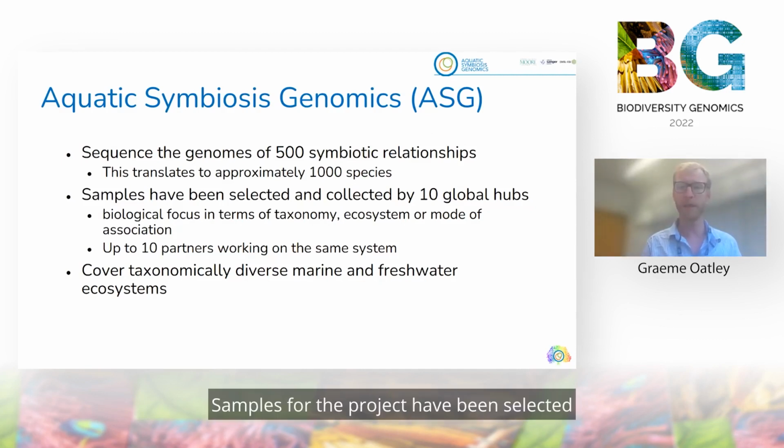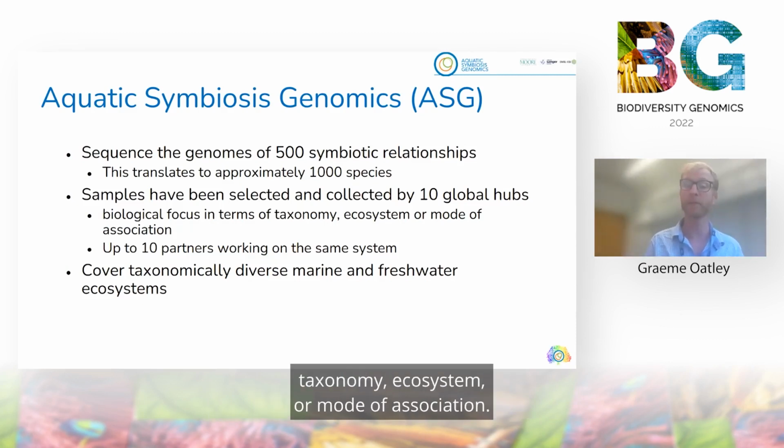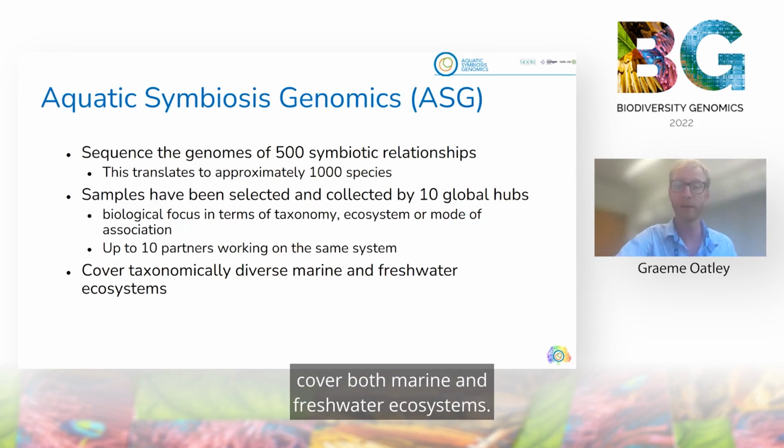Samples for the project have been selected and collected by 10 global hubs. Each hub shares a biological focus in terms of taxonomy, ecosystem, or mode of association. These 10 hubs are taxonomically diverse and cover both marine and freshwater ecosystems.